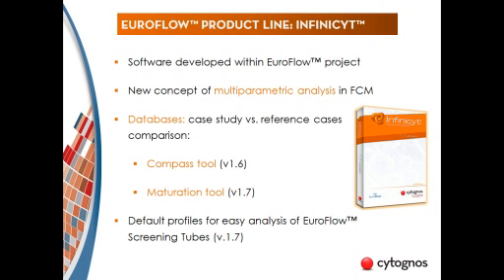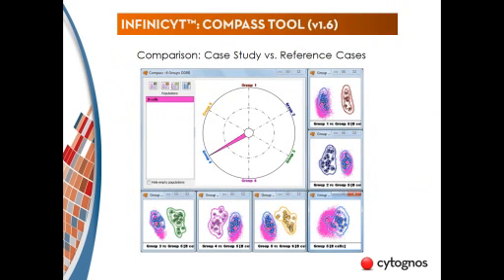This is an example of the comparison of your data with the databases. At any moment that you have a new case that you don't know what it is, and you are following the whole EuroFlow approach, you can just tell the software, please compare this case against all cases I have in the database, and it will give you an orientation about what your case is, if it is a disease, a group of reference, or another.